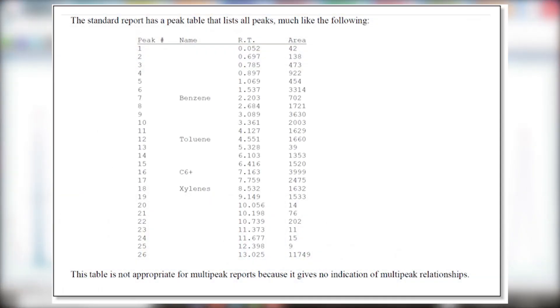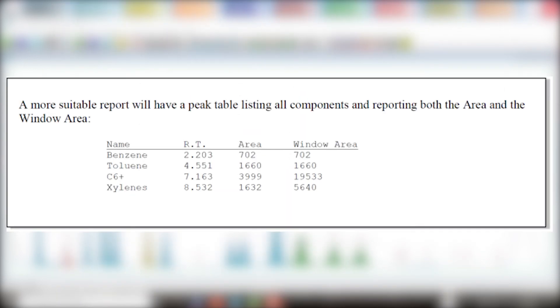Let's look at how this is reported. The standard report has a peak table that lists all peaks, much like the following. This table is not appropriate for multi-peak reports because it gives no indication of multi-peak relationships. A more suitable report will have a peak table listing all components and reporting both the area and the window area.